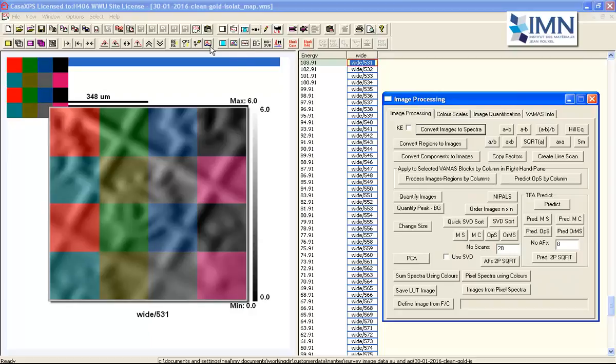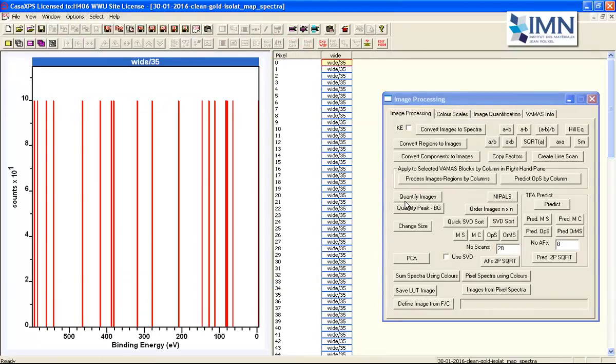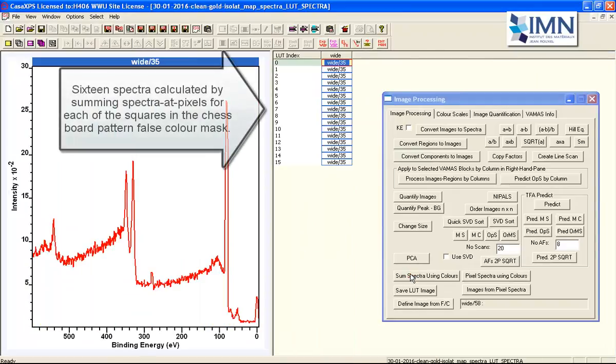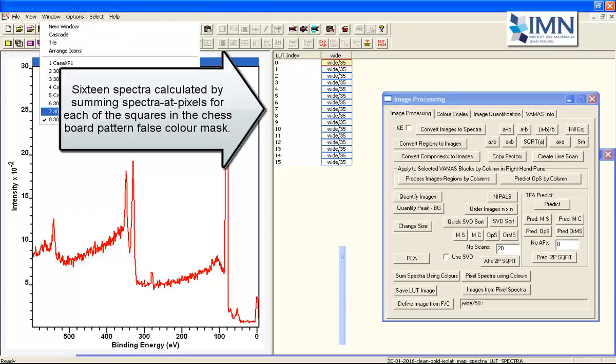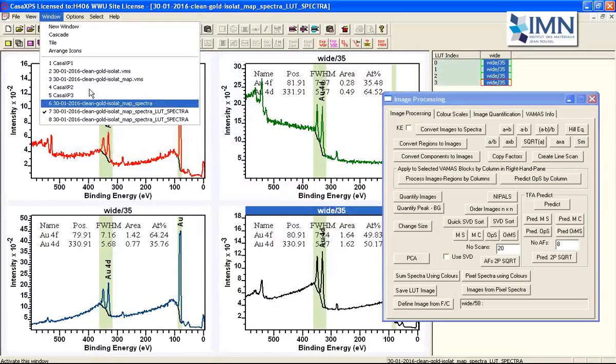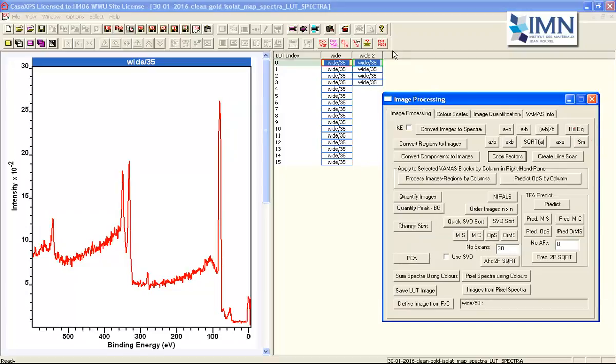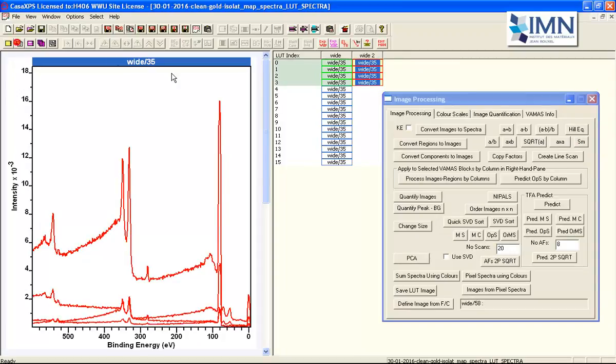If we now take the 4 spectra that were constructed looking at the differences in that registration, we can break down the data set into a more systematic, smaller area analysis based on the chessboard pattern, and then we can use the 4 spectra that we calculated as the basis functions to see how these small area analyses reflect these registration issues.